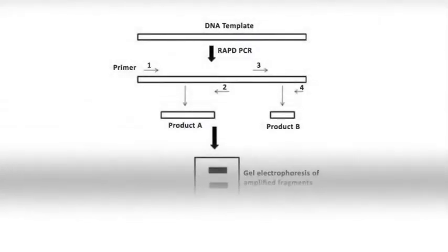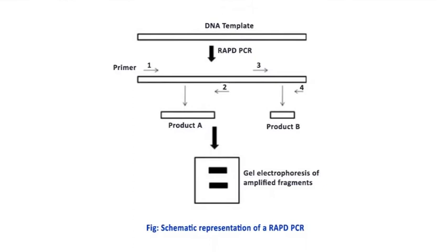targeted gene. DNA profiling of plant samples by random amplified polymorphic DNA or RAPD technique involves the isolation of genomic DNA from the sample tissues as the first step. Although different parts of the plant like flower petals, seeds, pollen grains, roots, rhizomes, tubers, and even dried wood can be used as materials for DNA isolation, fresh leaves are commonly considered as the standard materials for plant DNA isolation.